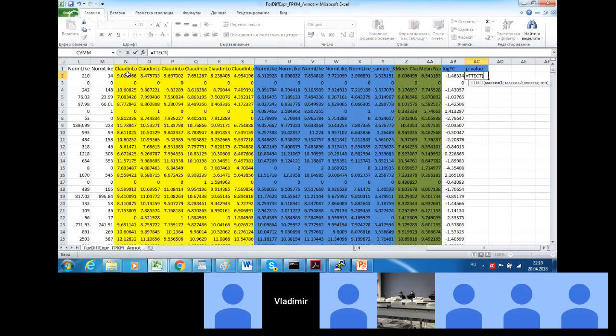And here we need to specify the first group of samples, the second group of samples, the p-value type, one-tailed or two-tailed, standardly it is two-tailed, and finally some statistical parameter related to our assumption about variation of two samples.